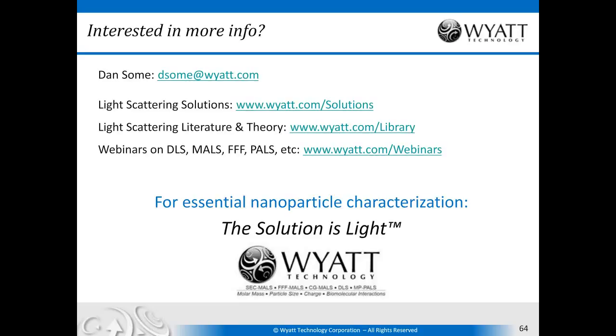Another possibility is that it's glycosylated, or some other type of post-translational modification occurs. If your expected molecular weight corresponds to the neat protein without glycosylation or PTMs, the light scattering will measure the entire molecule with the glycosylation or the additional modification, and will give you, again, the actual solution state of that protein.